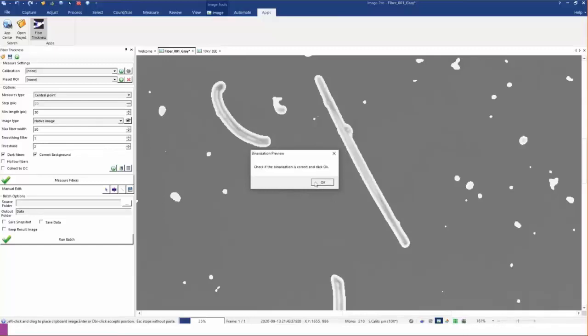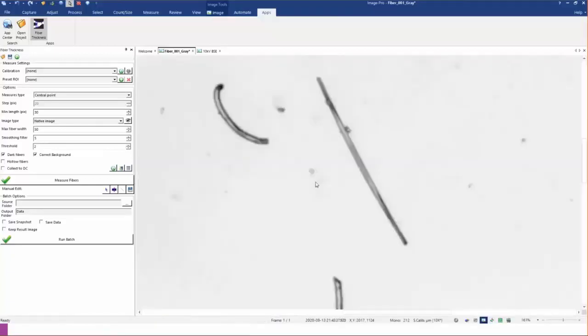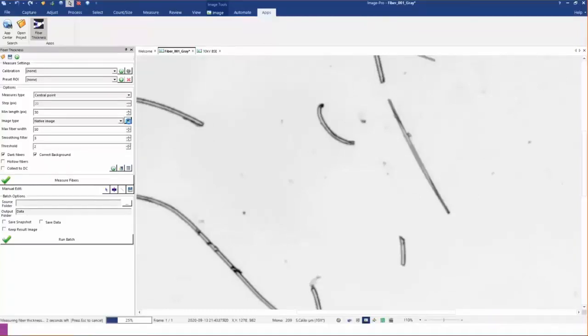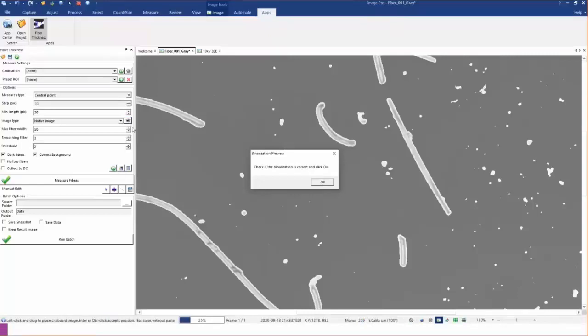A couple things going on. So how can we deal with this? One is there's a bit of smoothing going on, so it's probably blurring the edges a bit. So typically we can lower that a bit. You can preview, again changing one image at a time, a little experience. Getting better, still not quite there, but you can see it's certainly tightening up those edges.